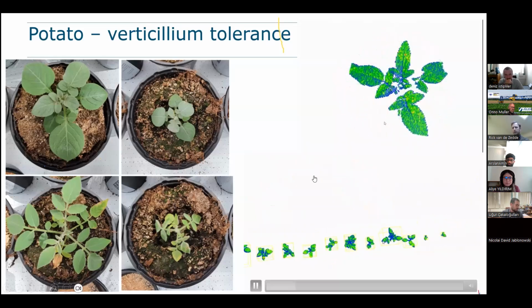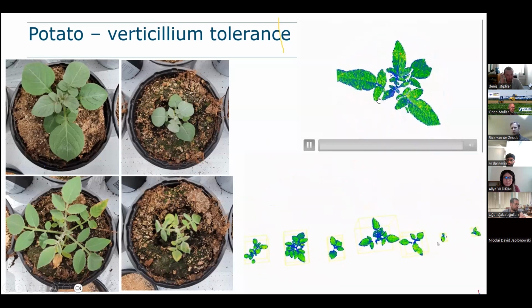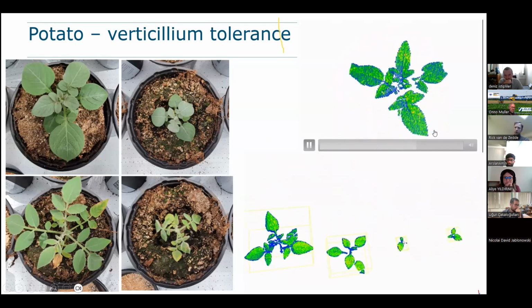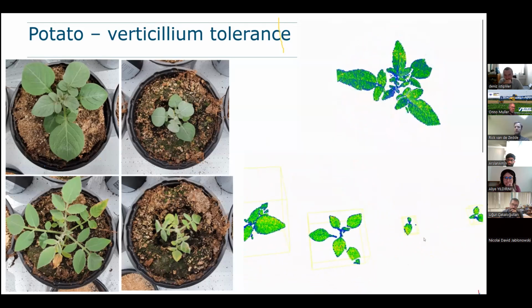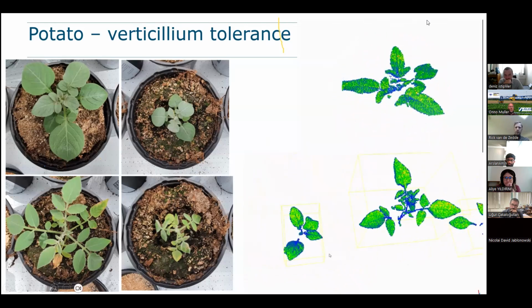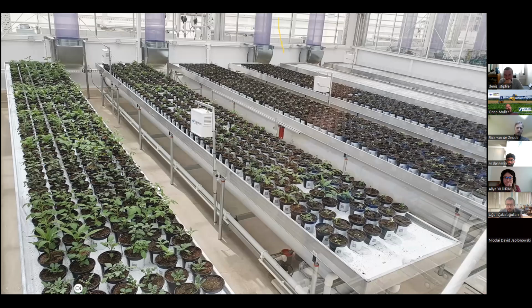And the growth curve is generated by making a 3D scan of each individual pot. And then we simply add all the points together, which is a proxy for the fresh weight. That's it. So we have a lot of tools out there. We scan all these plants and we estimate the total volume of your shoot on the top. We plot it over time. We select the ones that are in the treatment table while still being quite green and big over time. And those are the genotypes that were suitable for the next level, which is a field trial.